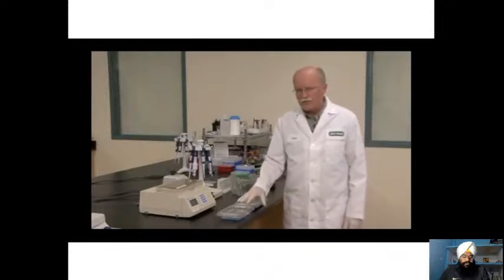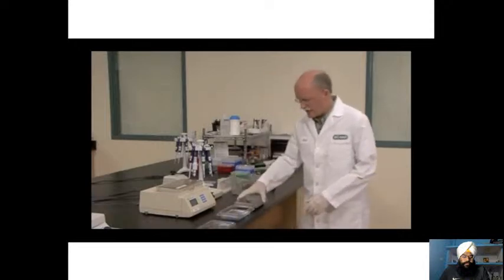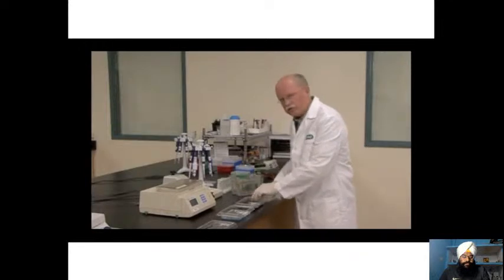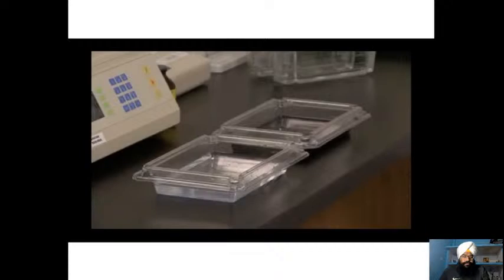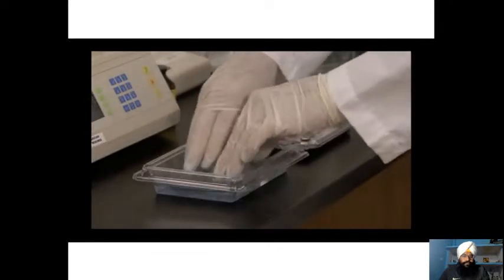We are now going to stain the gel using Bio-Rad's BioSafe Coomassie stain. Following the 3 10-minute water washes, we're going to transfer the gel to a tray of BioSafe Coomassie, and we are going to stain the gel for 45 minutes to 1 hour. Following staining, we are going to transfer the gel from BioSafe Coomassie back into water, and we are going to destain until you get the desired background. At that point, the gel will be ready for imaging.